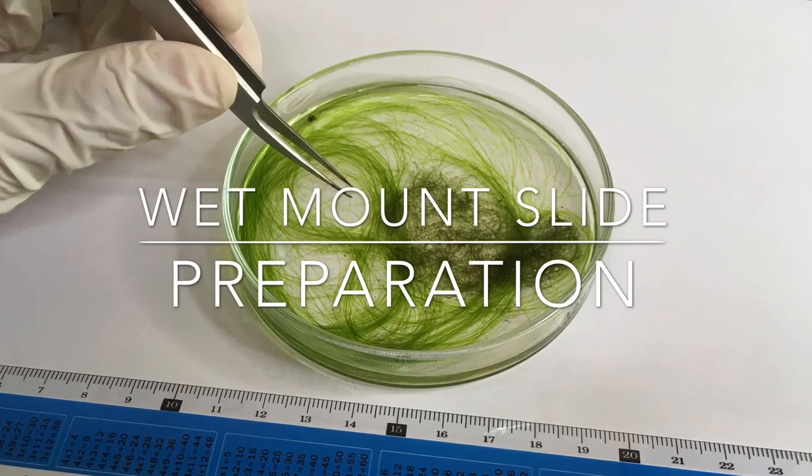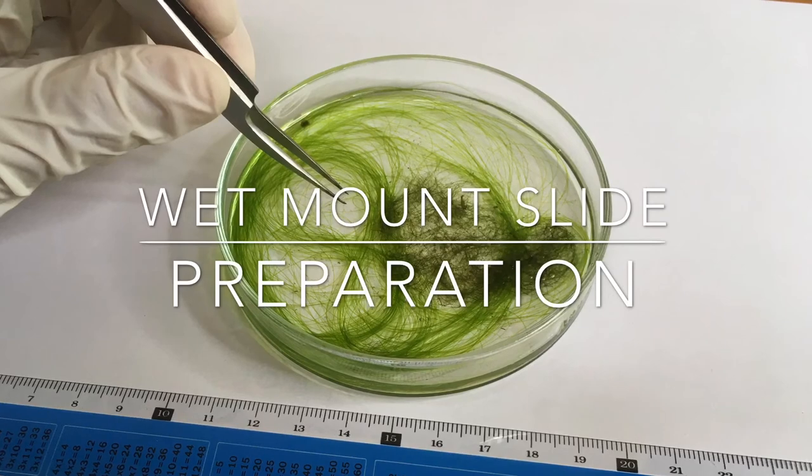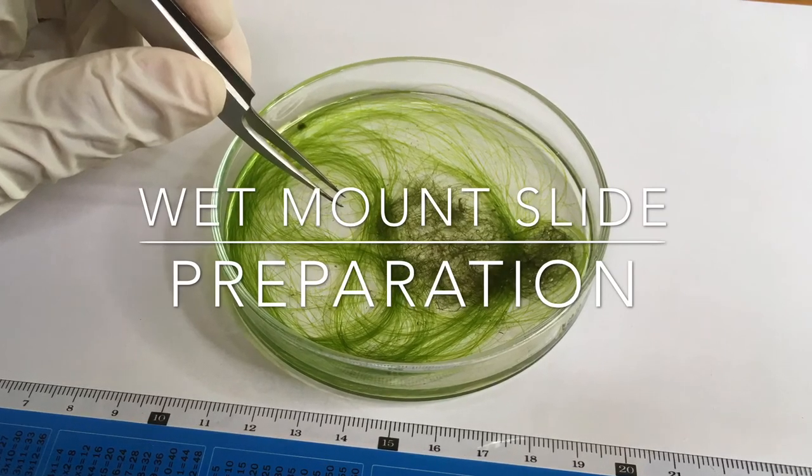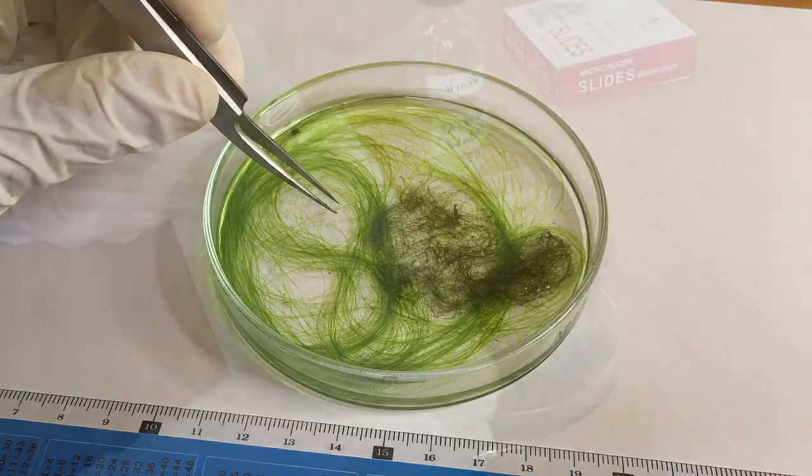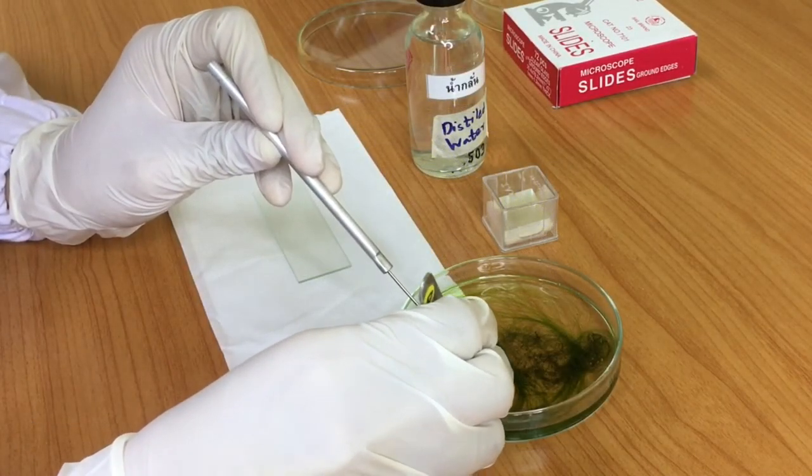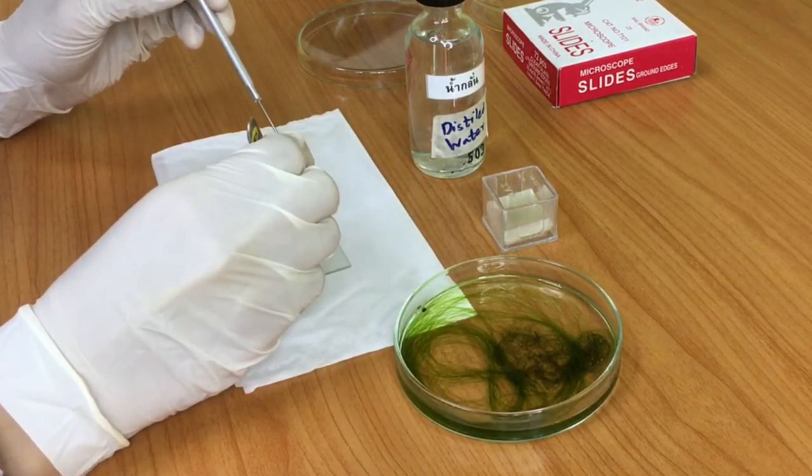A wet mount slide is a temporary slide of a specimen. The specimen slide is prepared using small amount of water to hold the specimen under a cover slip. We will explain steps to make the wet mount slide.